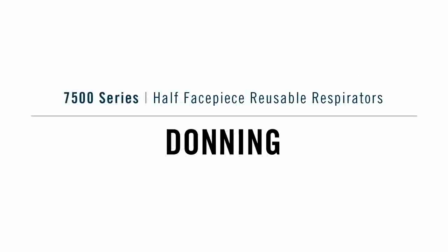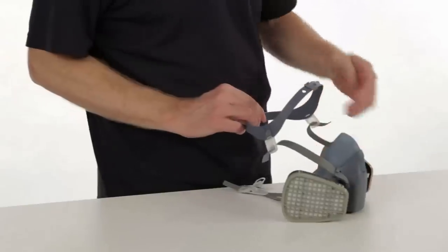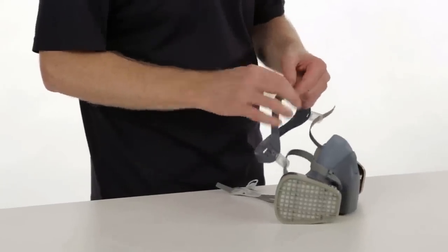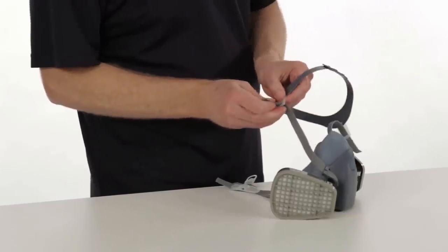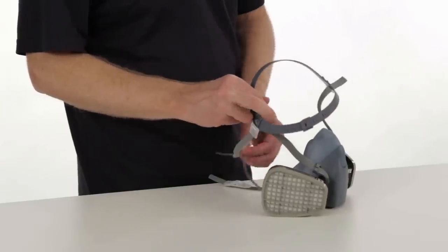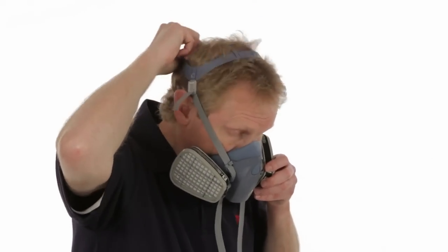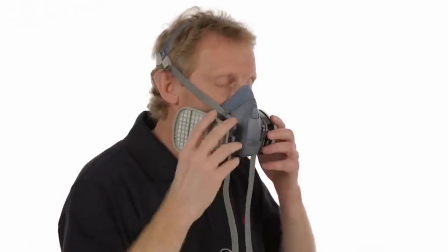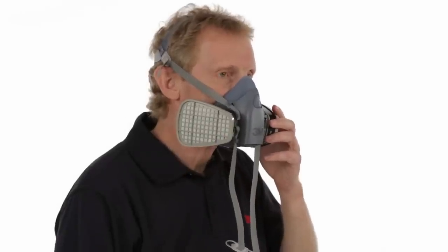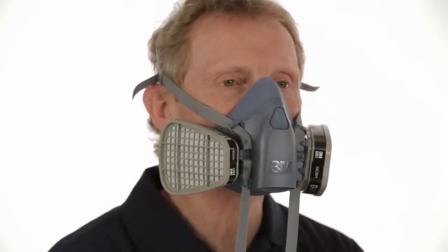Donning the 7500 half-face-piece respirator can be done one of two ways: standard fixed suspension or drop-down suspension. Let's cover standard fixed suspension first. Before you put on your respirator, make sure the straps are beneath the locking tabs, untwisted, and pulled far enough through the buckles to permit easy grasping. Adjust the head cradle size as needed to fit comfortably on your head. Place the respirator over your mouth and nose, then pull the head harness over the crown of your head. Position the facepiece low on the bridge of your nose for the best possible fit and to prevent the respirator from blocking your vision.